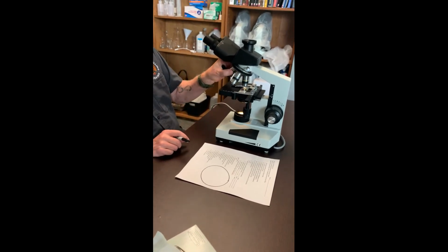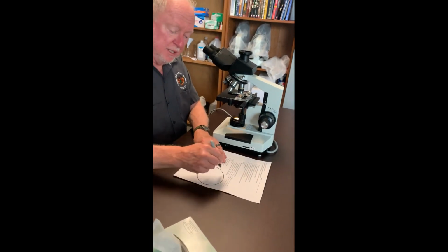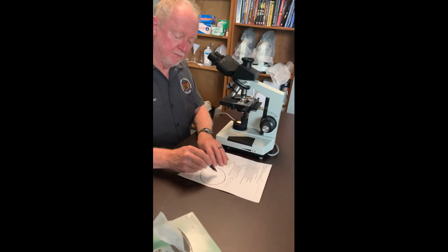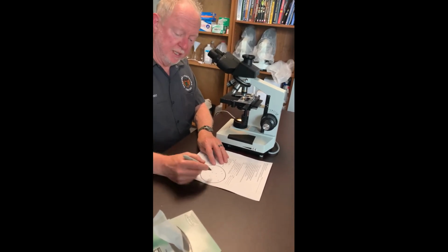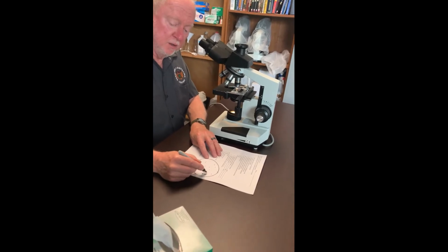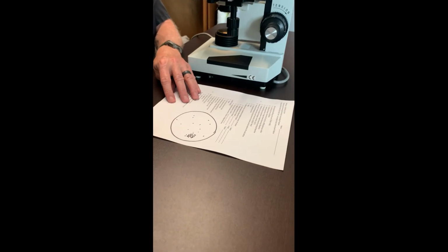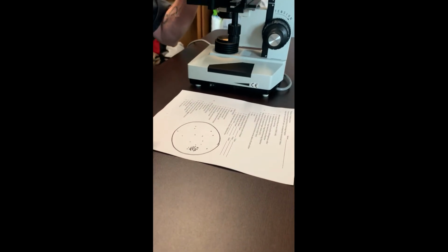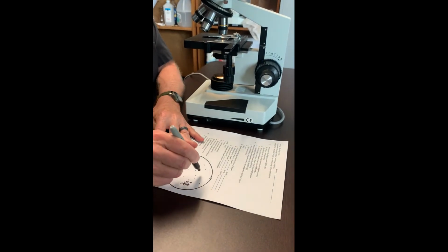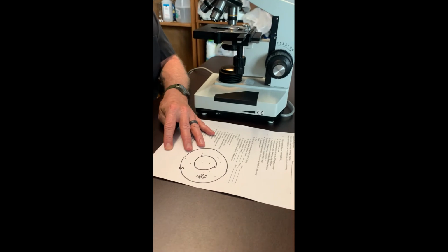When I turn to the higher objective, higher magnification, my field of vision changes. Let's say the stuff I'm trying to see is over here towards the perimeter of our field of vision. Every time that I go to higher magnification, my field of vision gets smaller. So there's my scanning field of vision.